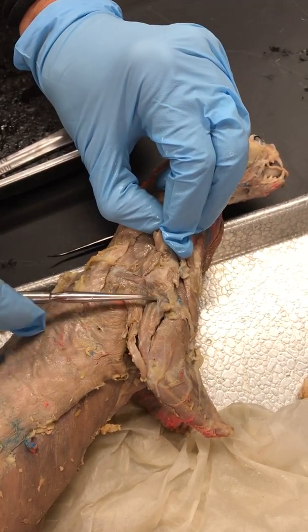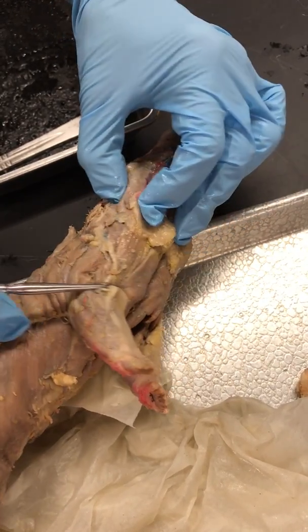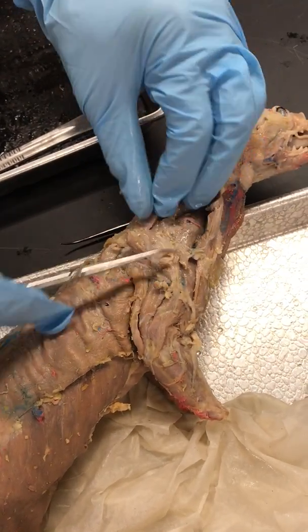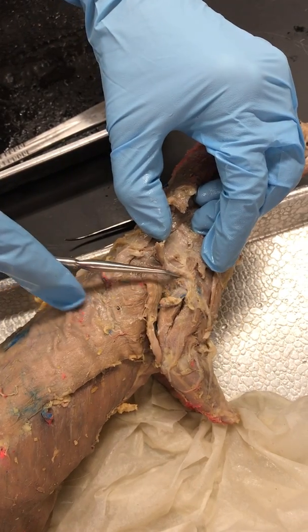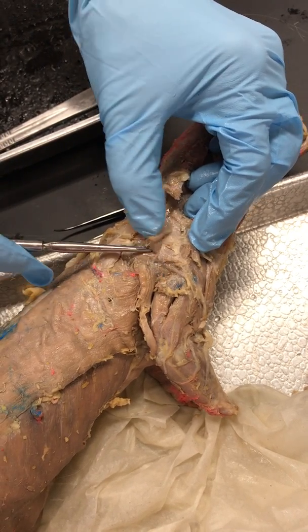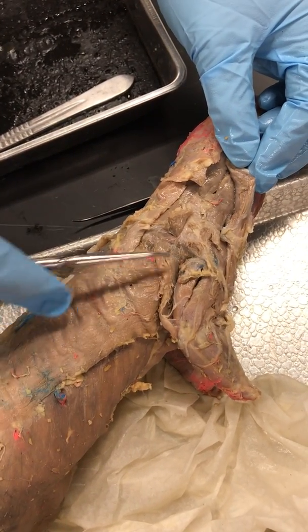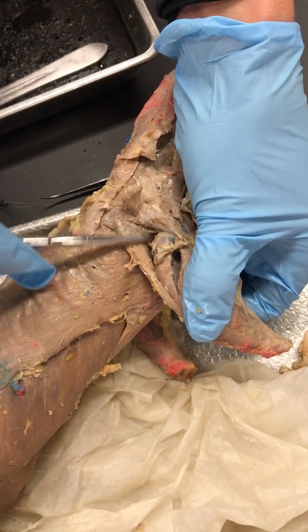And then that's Triceps Brachii Long Head, Triceps Brachii Lateral Head, and you have Brachialis on the front there. And then this is Acromiodeltoid right there — it's kind of a long skinny muscle. It's a little bit harder to separate from some of the others, but it basically runs from the top of the Triceps Brachii Long Head to your Infraspinatus.